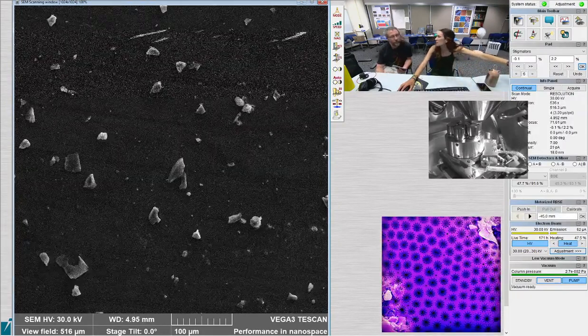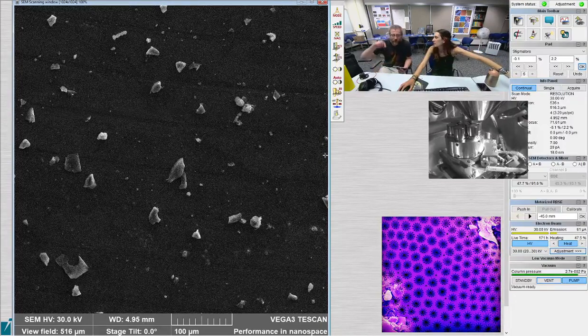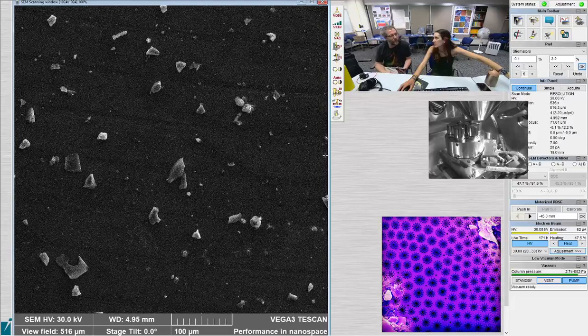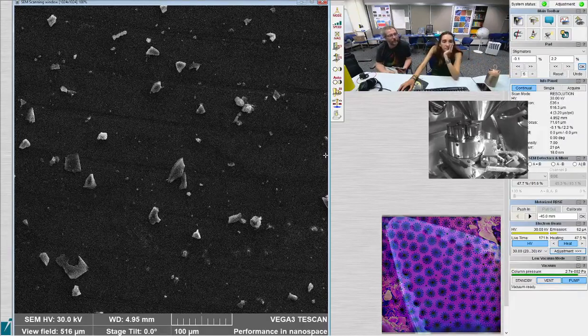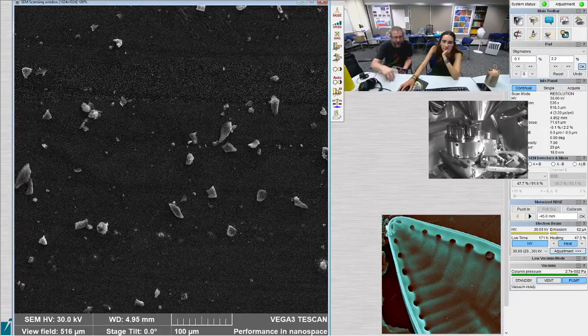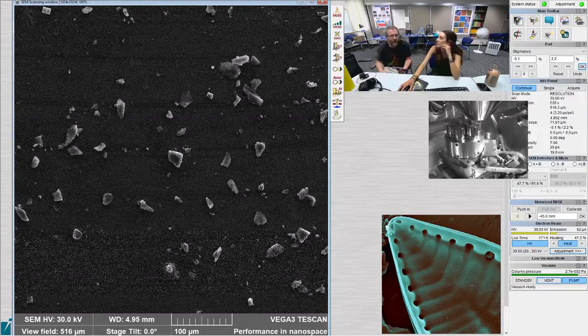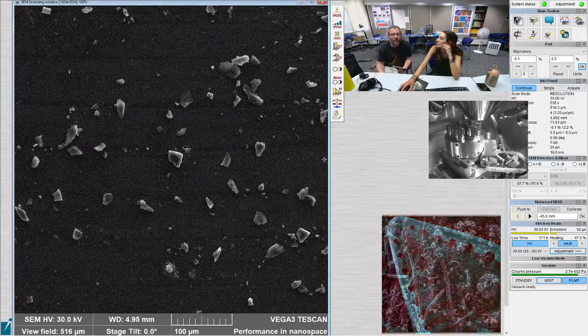Would this be the most appropriate thing to figure that out? If you're trying to look at a specific point, then yes. Because none of the other tools can really do that. If you're looking at an individual tiny band, a couple microns wide, there's not an easy way to do that with most of the other tools.